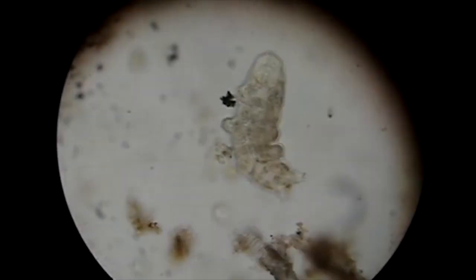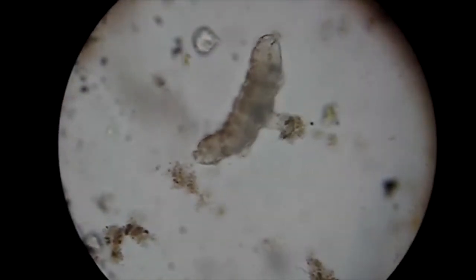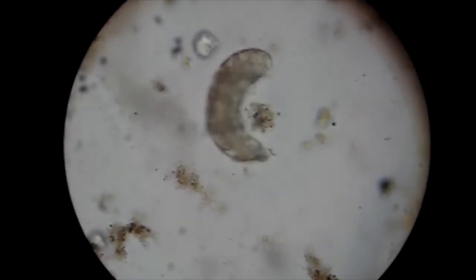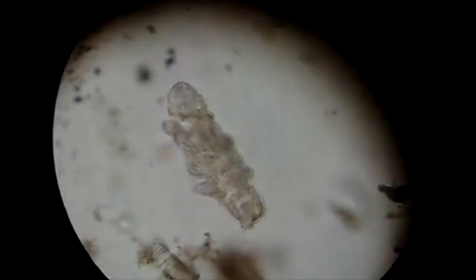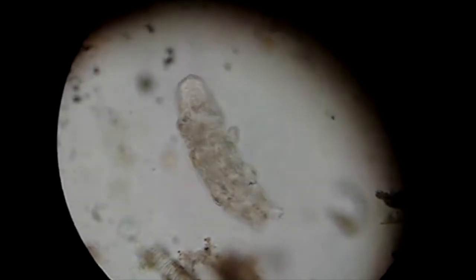Right, look out for his eyes. You'll see them in a second. There. This is another reason why they're quite cute, because down a microscope sometimes you get the feeling that they're looking back at you. Right, this side view here, this is why they're often called water piglets. Can you see? It looks almost like he's got a little snout on the front of him. Really cute. So loads of people are particularly fond of these. Here's another view of the underside of it, where every so often you see the eyes, and it really looks like it's looking back at you.